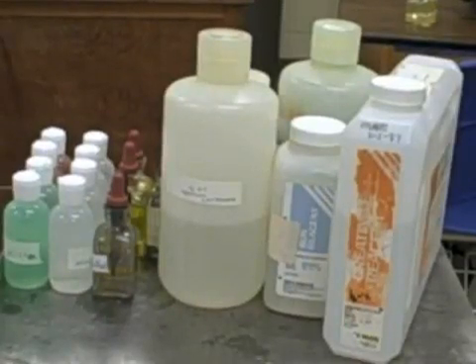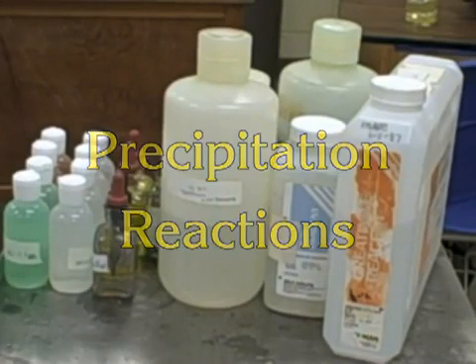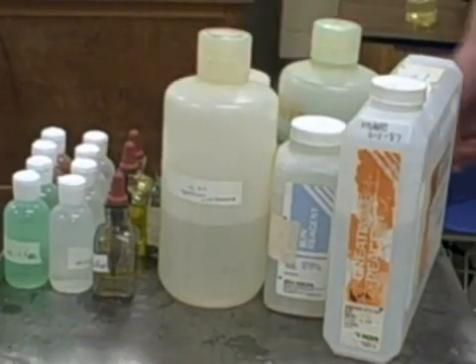So today we're going to be doing some precipitation reactions, and basically a precipitation reaction is when two soluble reactants come together to make an insoluble product and a soluble product, which is the byproduct there. And so we're going to be precipitating all kinds of stuff today.